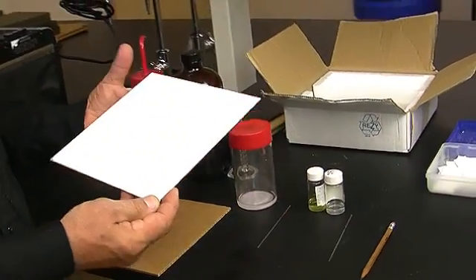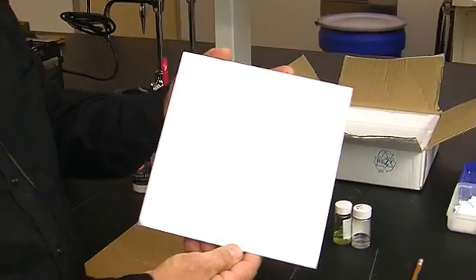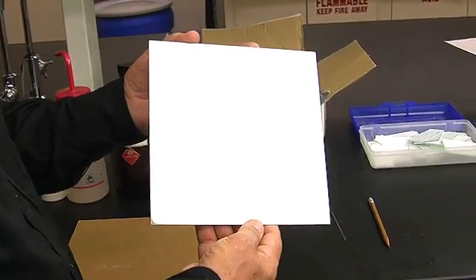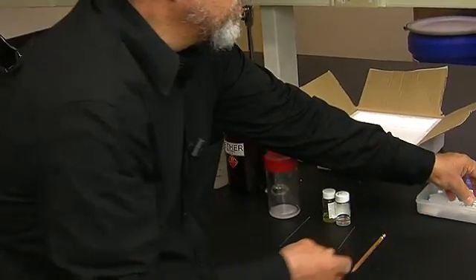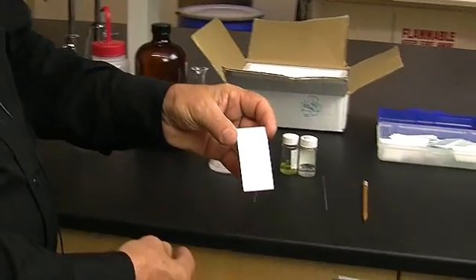The first thing the student has to know is that the TLC plates we use in the laboratory are cut from these very large plates which we buy. We call these stock plates, and these stock plates provide us with the TLC plate that we're actually going to use in our experiment. Here is the actual size of plate that we're going to use.